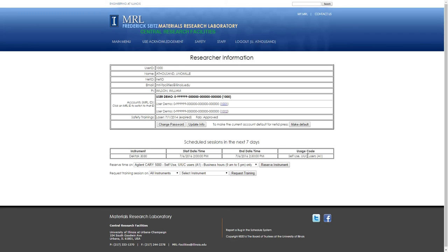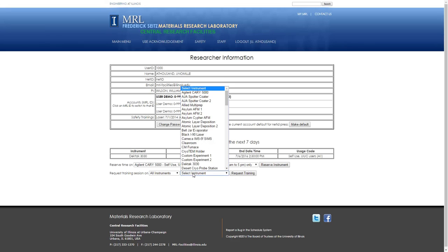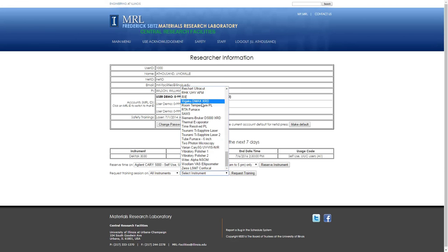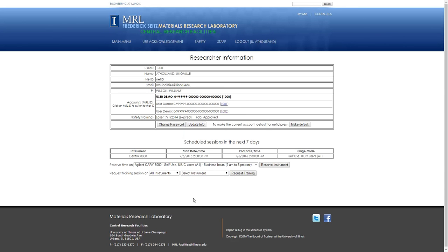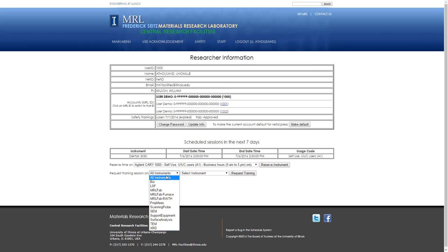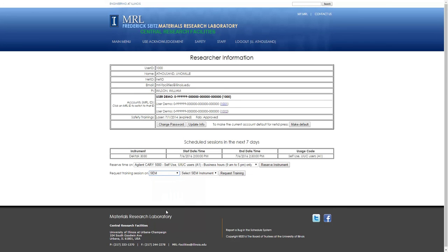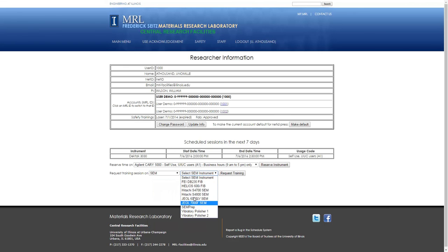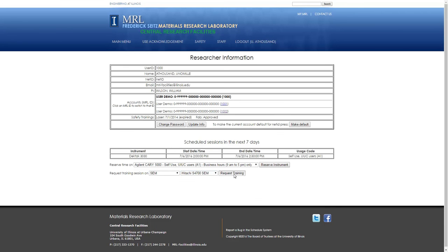Now, in order to get instrument permissions so that you can sign up for time and reserve the instrument, you need to request a training session. You can select from the alphabetical list of all the instruments, but it might be hard to figure out which instrument exactly you want without reading the whole list. So, you can look through the list of instruments here, say the SEM category, and this narrows it down a little bit. Let's choose the 4700 and click Request Training.